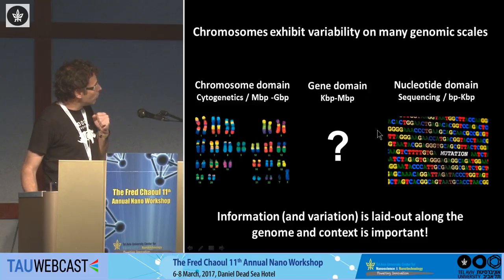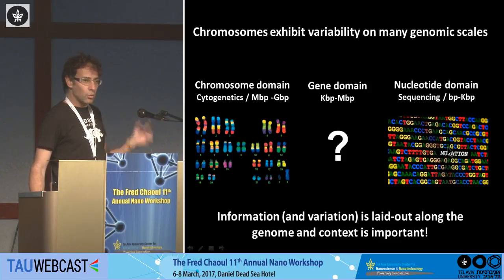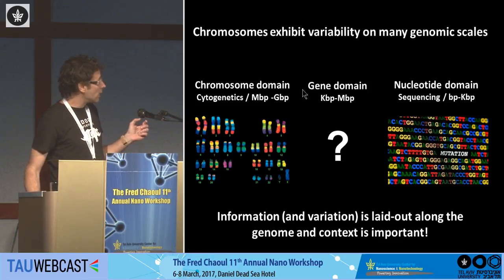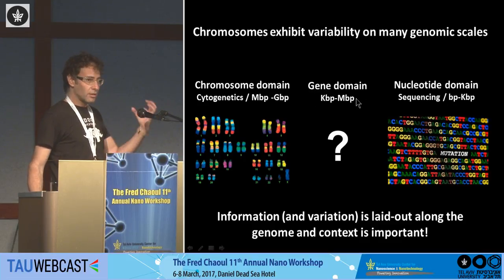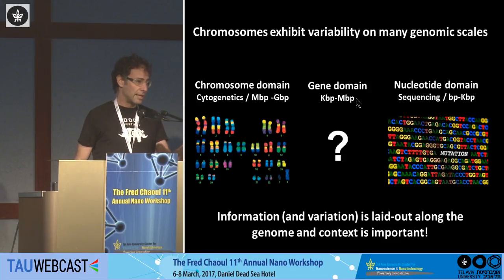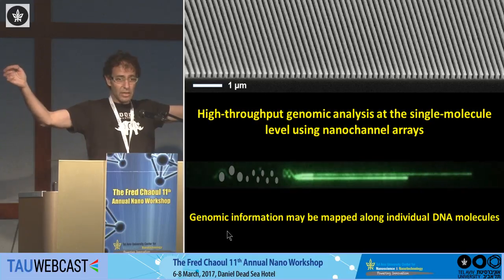Basically, we are trying to probe a region in genomics that is not really addressed by existing technologies. So when we do sequencing, we know how to sequence very short pieces of DNA, up to a few hundred bases. When we do cytogenetics, we know how to look at extremely large pieces of DNA, millions of bases. But actually, in a very, very important domain of sizes, which are the sizes of our genes, there is no real technology that can probe these length scales of DNA. And what we try to do is basically take these chromosomes and unravel them so that we can stretch very, very long pieces of DNA, hundreds of thousands of bases to a few million bases.